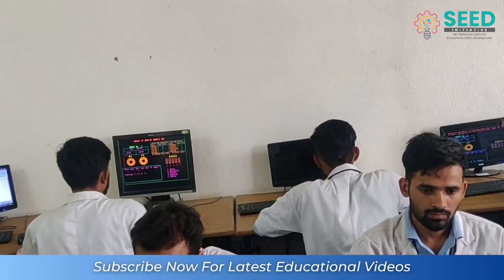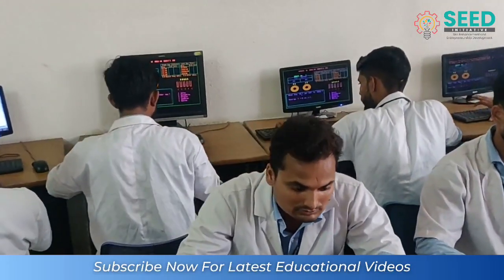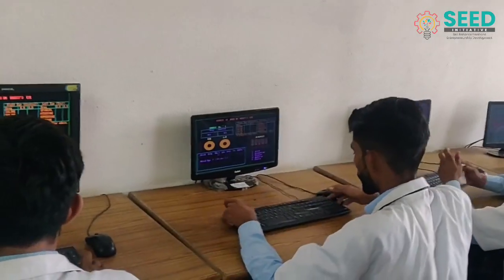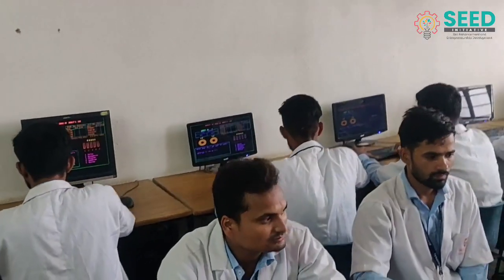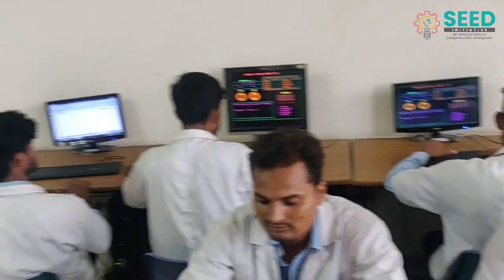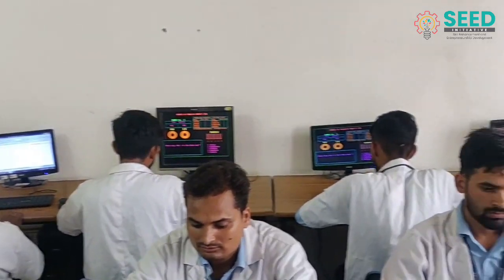Select number 5. Press any key. Press yes. Y. Yeah. Now type number 5. Now type R. Now type 4.